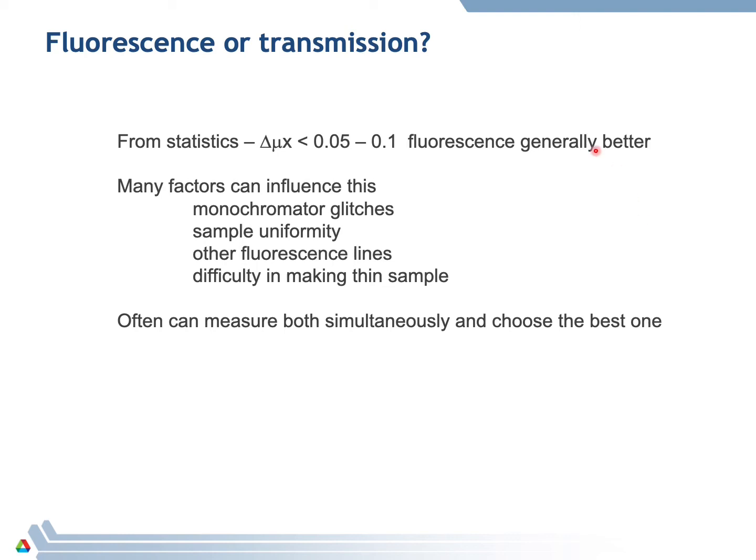So you don't always have to choose one or the other at the start. If the sample is thin enough, you can do both and choose the one that looks the best at the end.